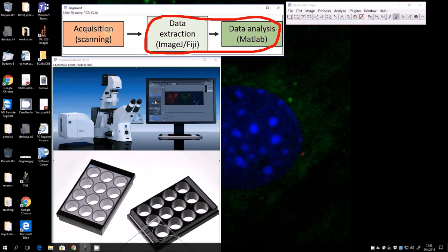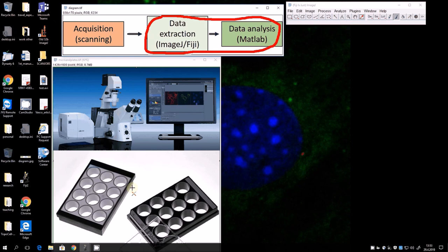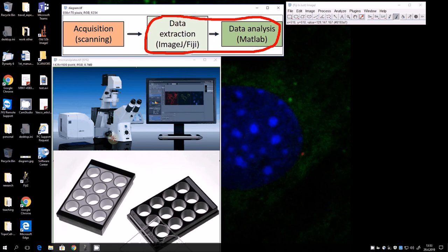There is one more important part completely outside the focus of this video: the wet lab work. In our case, we are growing C2C12 cells, but the tool can be used with any kind of cells, or even to analyze microscope slides — not necessarily plates. All immunohistochemistry and cell growing steps are not covered here. We start from the point where we have produced our CZI file.